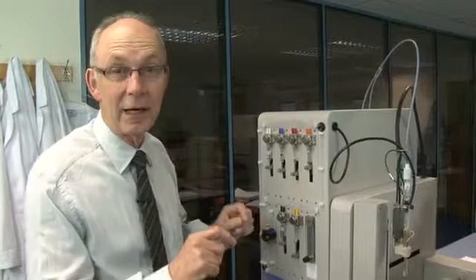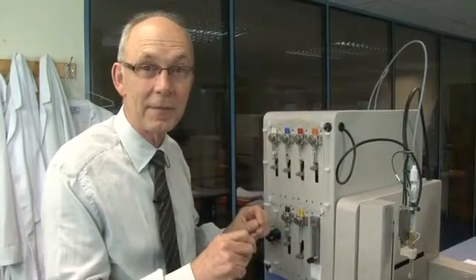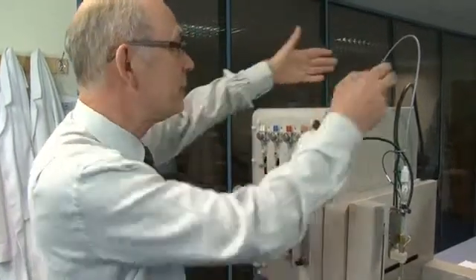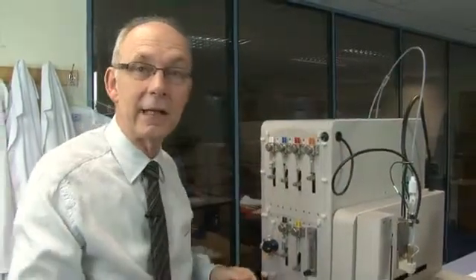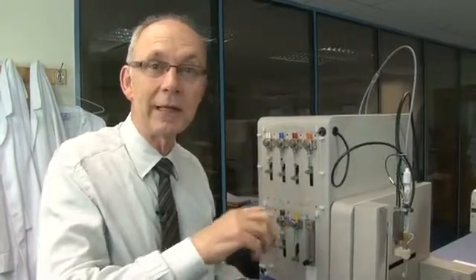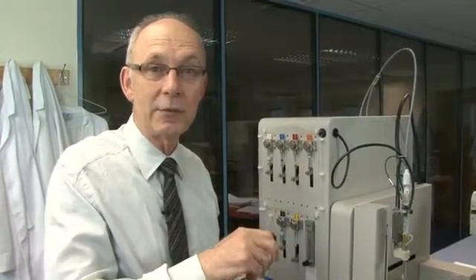It's a tiny little volume, hard to visualize how small it is. But also in here we have this probe. This is an ultraviolet dip probe. This brings ultraviolet light through a tube, puts it onto a quartz mirror, bounces it back and it can look at changes in light absorbed during the experiment.